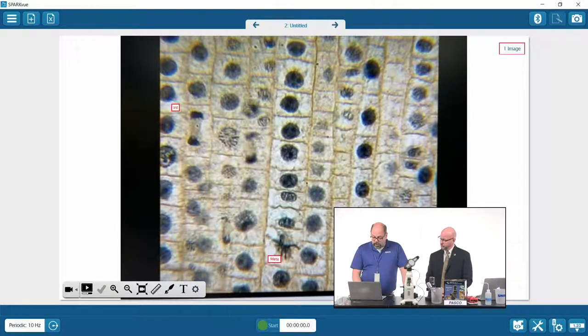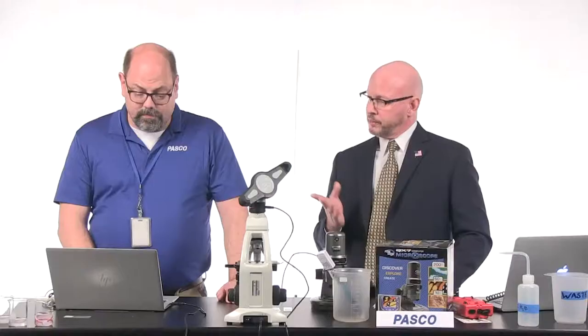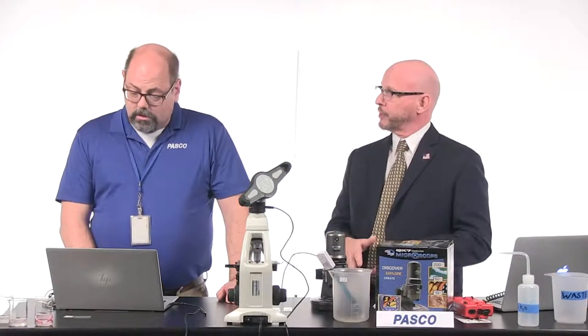If my students can work through this as a lab, they can find out that there are about 40 of the interphases, only about 35 prophases, and 2, 4, and another 4 of each of those divisions that we see in standard cells, even from the simplest to the most complex microscope pictures that we've taken. So this is a really great picture that you've taken, and this was done right here with the microscope that we're sending out to our folks.